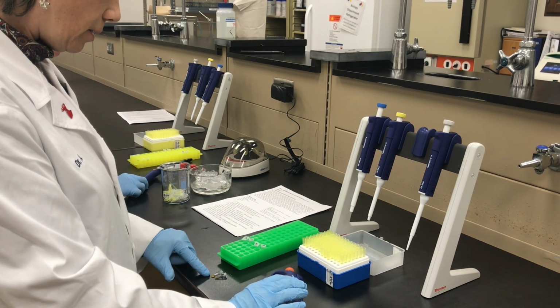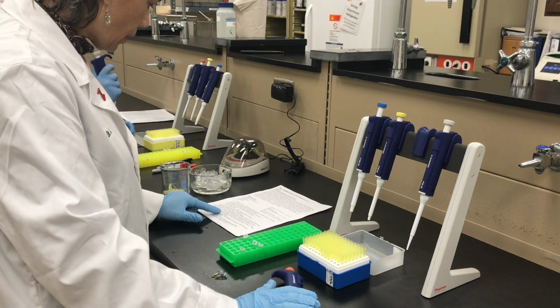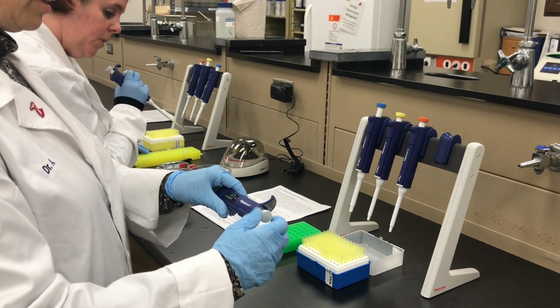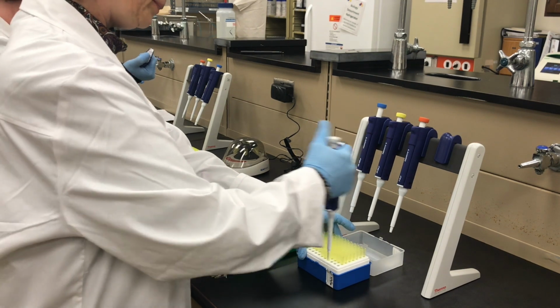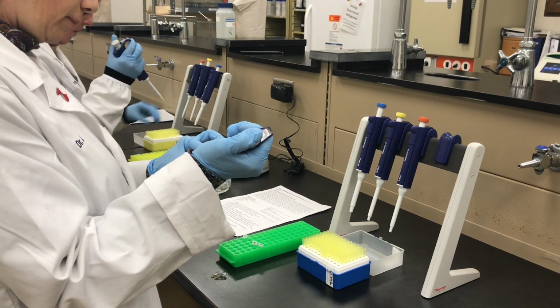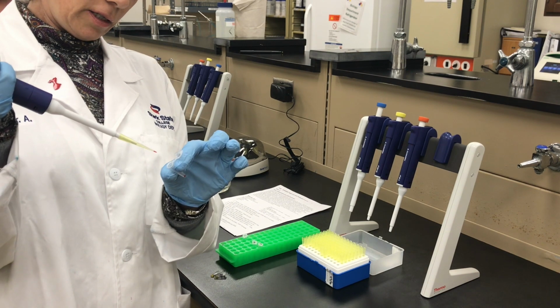So tube 1 is an A, B, C, or D. I'm going to give it the D. And how much? 2.5 microliters. We've got to go down to the gray top, down to 2.5. So, triangle, I'm doing D. If you could see this tiny little volume, that's all it is in the pipette tip.